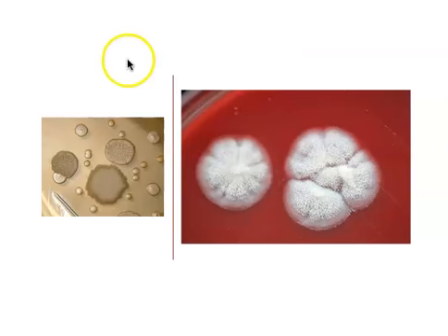And if I look over here on the left-hand side, I can see an agar plate with, again, lots of different kinds of colonies growing on it. And boy, I would guess that these are bacterial. They're nice and symmetrical. A lot of them are round. Lots of different colors, but really you might look at these and think, oh, these are bacteria for sure.